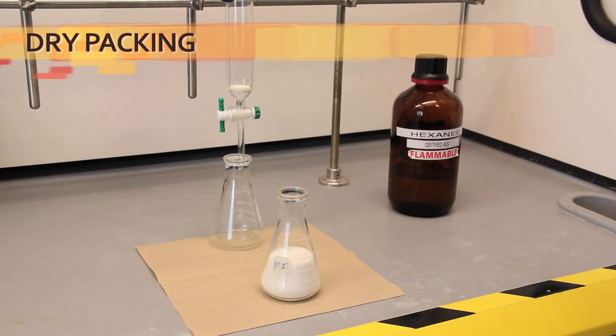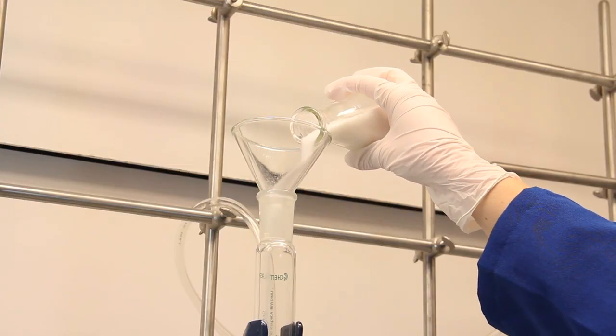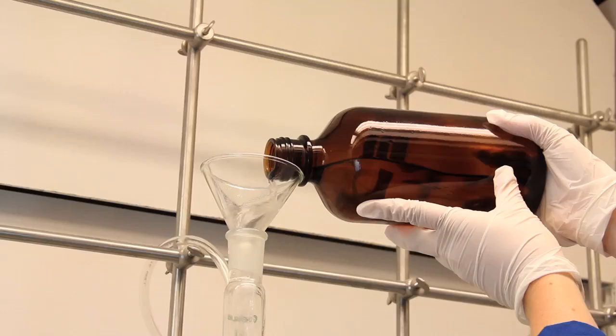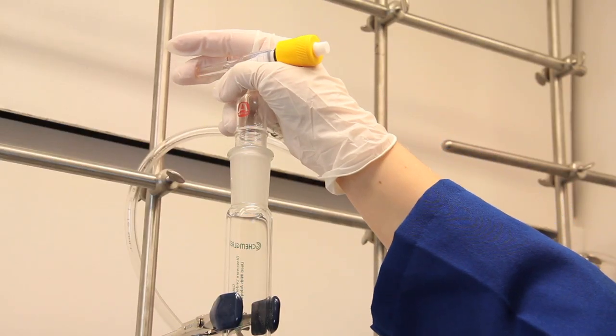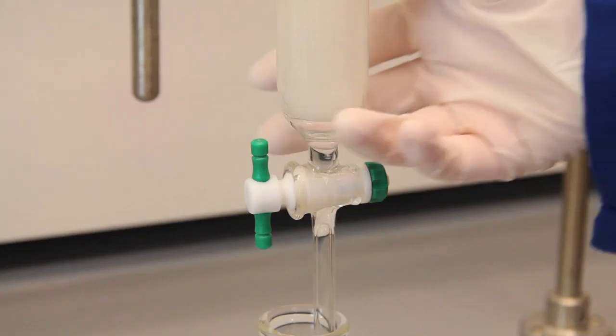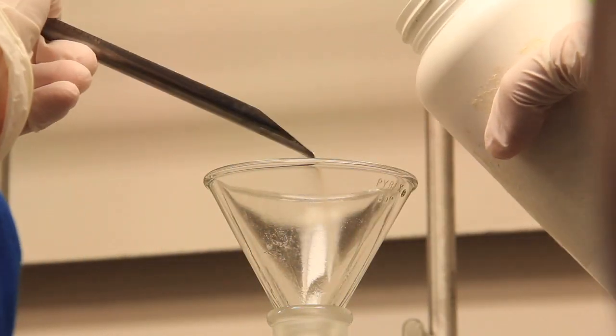An alternate method is called dry packing. You add dry silica gel to the column and flush with solvent. Continue flushing until all air bubbles are expelled and the column feels cool. I use air pressure to push most of the solvent through, but keep about an inch of it on top.